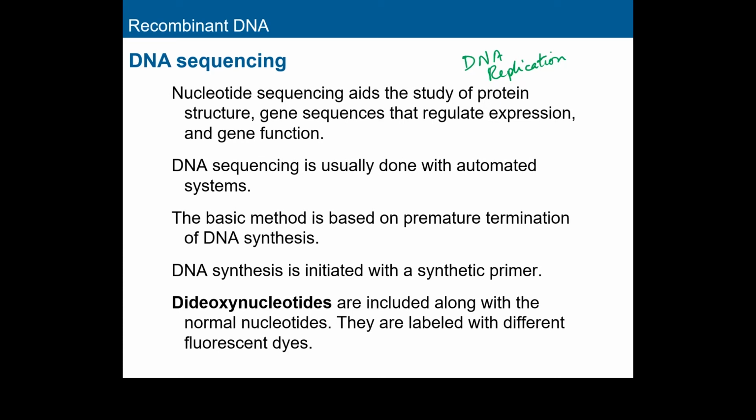Brilliant scientist. DNA sequencing is to get the entire sequence of the genome. Big projects have already been completed, and at the center of this technique is chemistry. Sanger was a chemist.